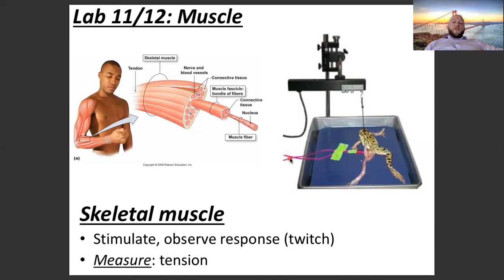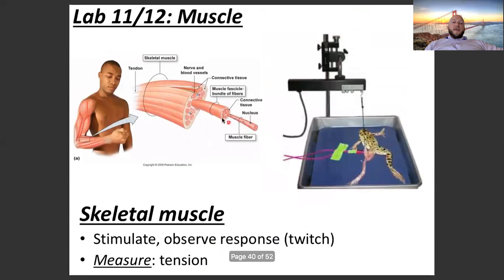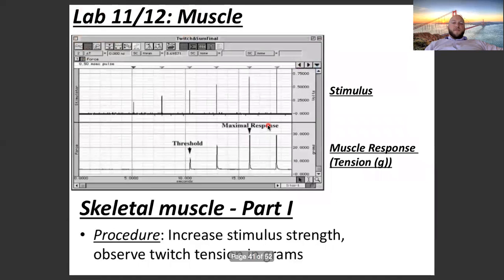When we first start shocking the muscle, we're not going to get any response, because the amount of force that we start shocking the muscle with is going to be below threshold. It's going to be sub-threshold. And as we increase the amount of force used, we're going to cause more and more muscle fibers to reach action potential. And when more and more muscle fibers reach action potential, we're going to be seeing spatial summation. We're going to be seeing an increase in force generated.